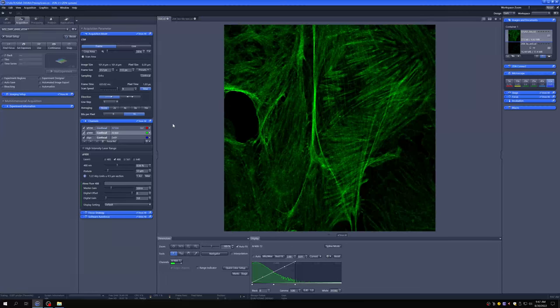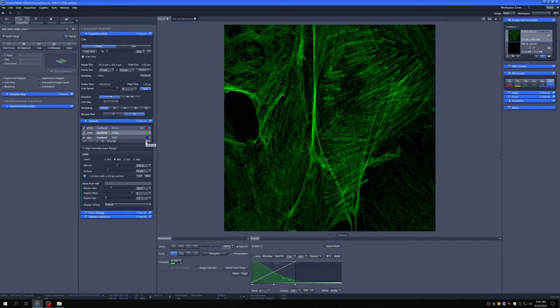I've placed the sample, focused on it by eye, and I've readjusted the settings for the 63x objective. Now, importantly, one of the things I had to readjust was the pinhole size.